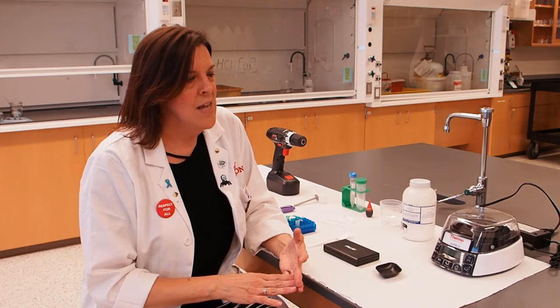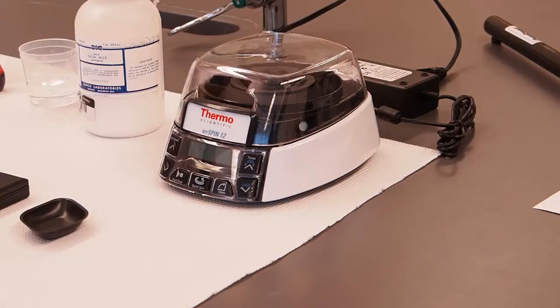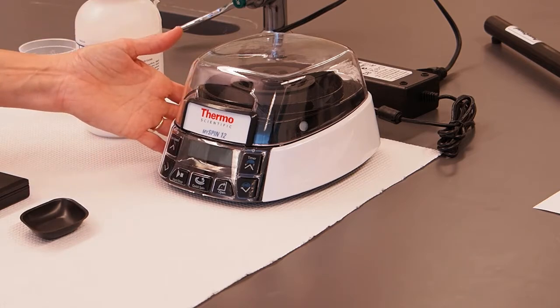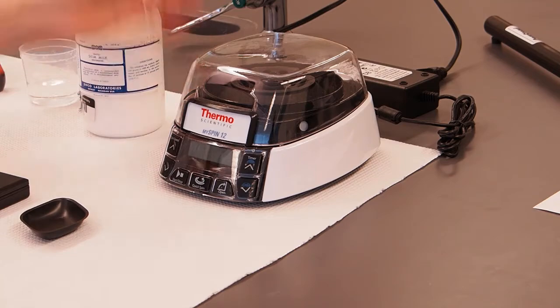We will be using centrifugation for that purpose as well as for pushing our sample through a filter type material. In a professional lab, a synthetic biologist might use a centrifuge that looks something like this. It holds microfuge tubes, which are the little tubes that we've been using to hold our samples.